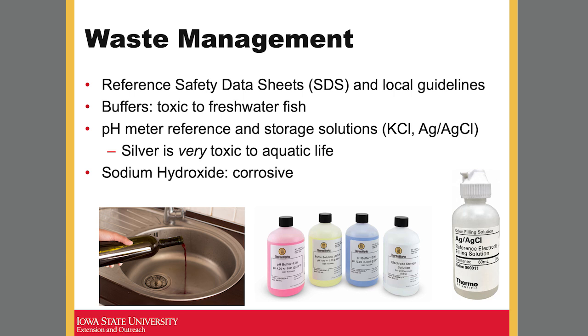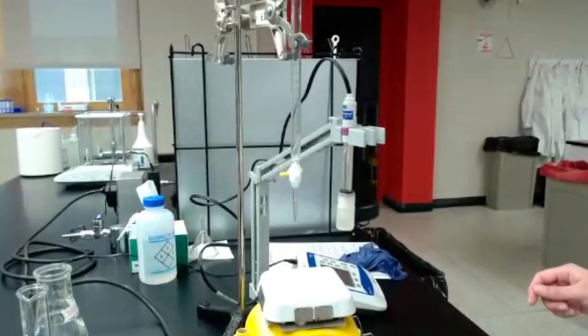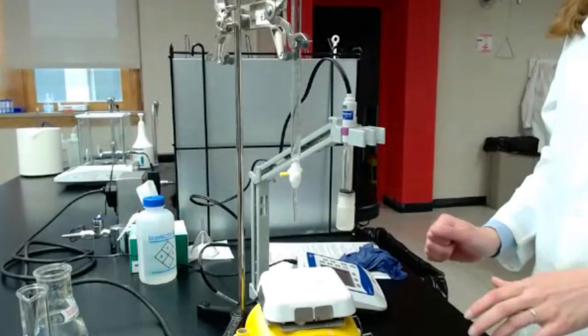I'm not sure how you handle the waste from labs, but make sure you handle it as appropriate. To learn more about waste management, you can go through the safety data sheet that comes with the sodium hydroxide solution. With all the chemicals you purchase, you should have those safety data sheets. So make sure you have a good understanding of how to manage that waste. We're gonna start talking about the demonstration.